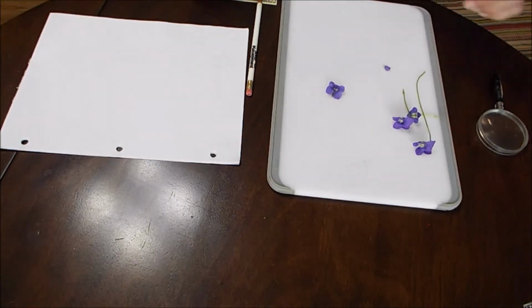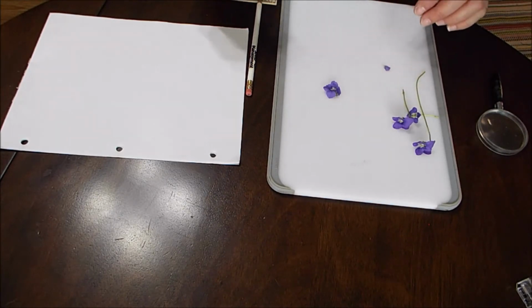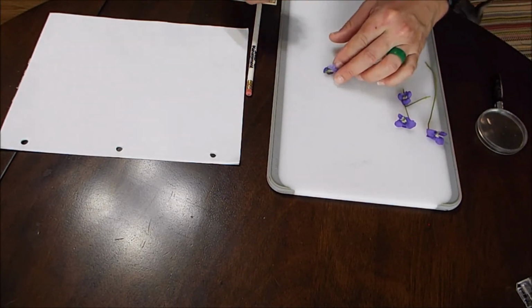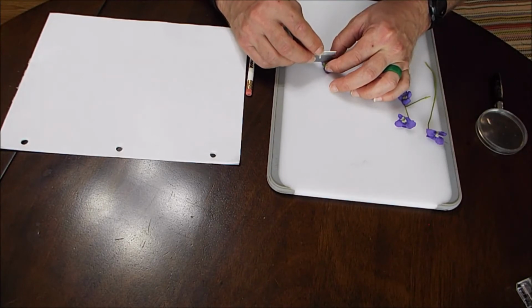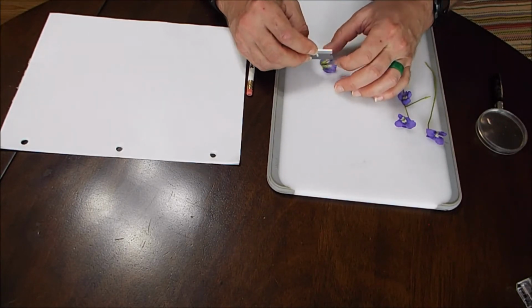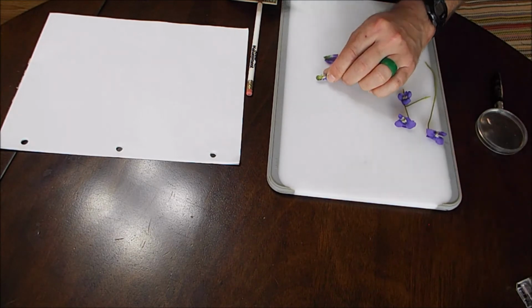Now the dissection. And I'm going to use a razor. Who am I going to use? Several different potential victims here. Maybe I will take this one. What I'm going to try to do is divide the flower right down the middle because the carpel is in there and that's where the ovules are. And I really want to get a view of the ovules. And there we have it, which is not too bad.